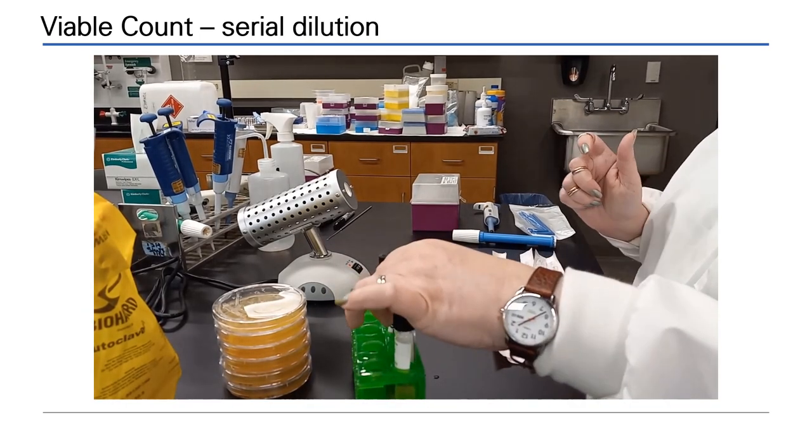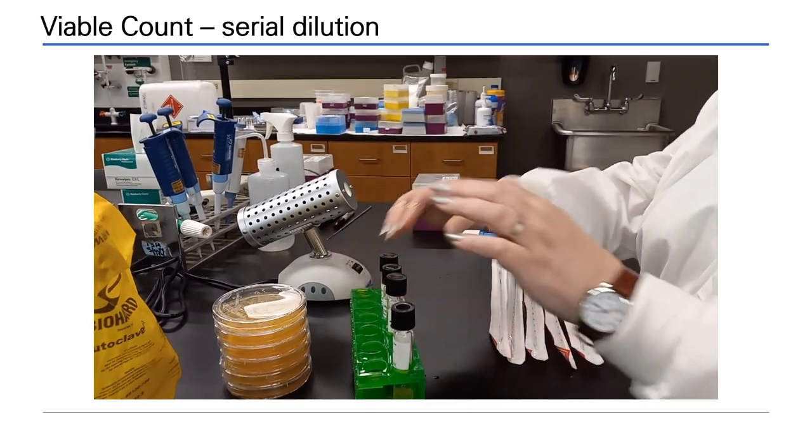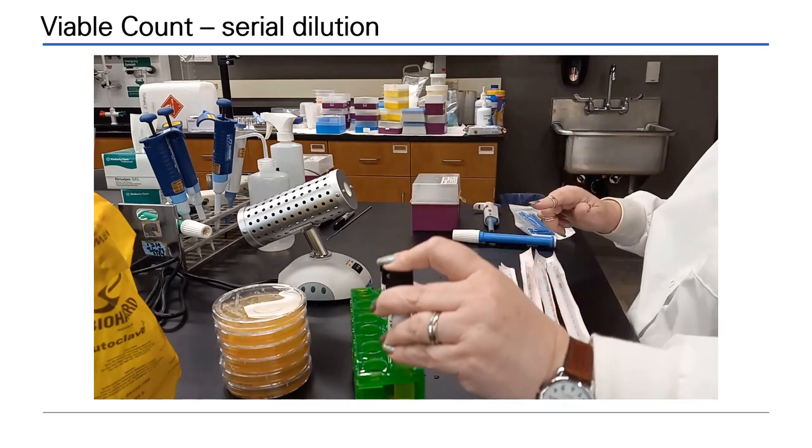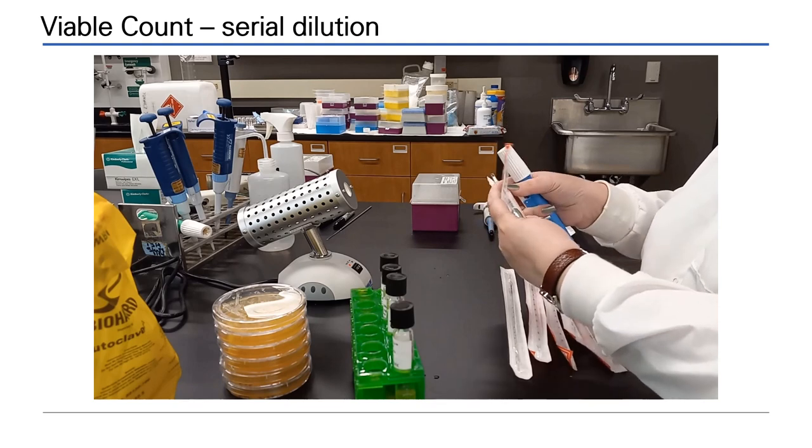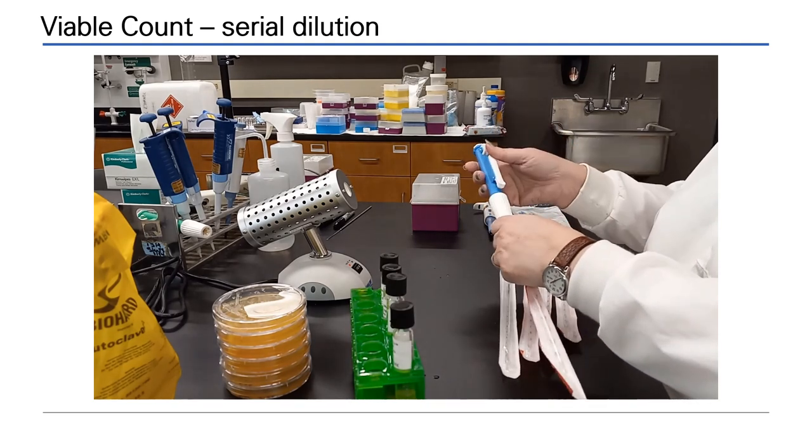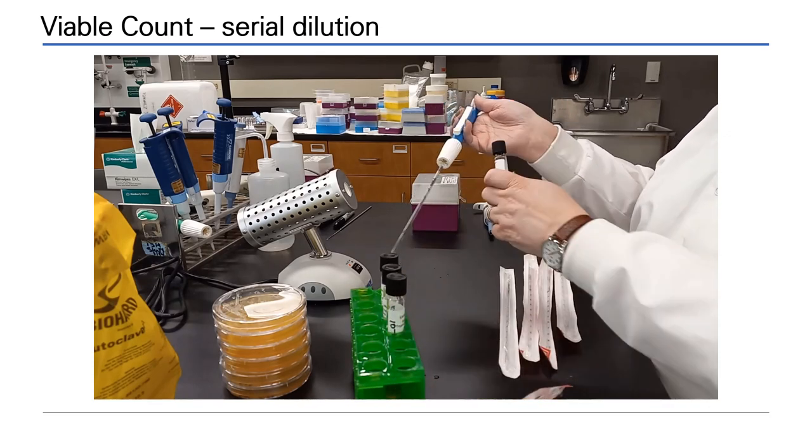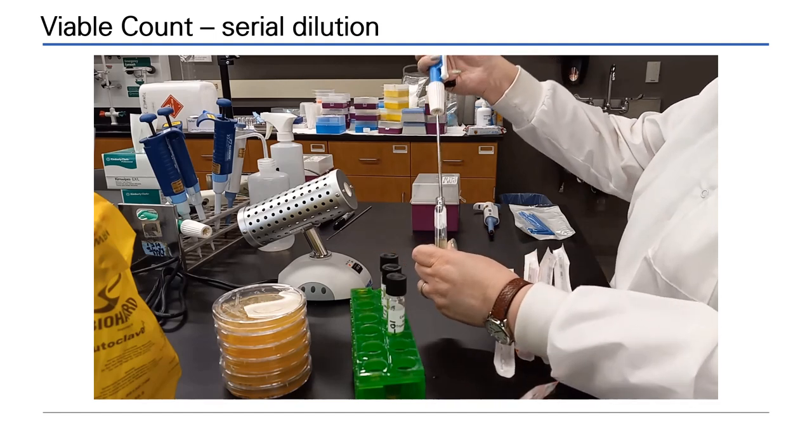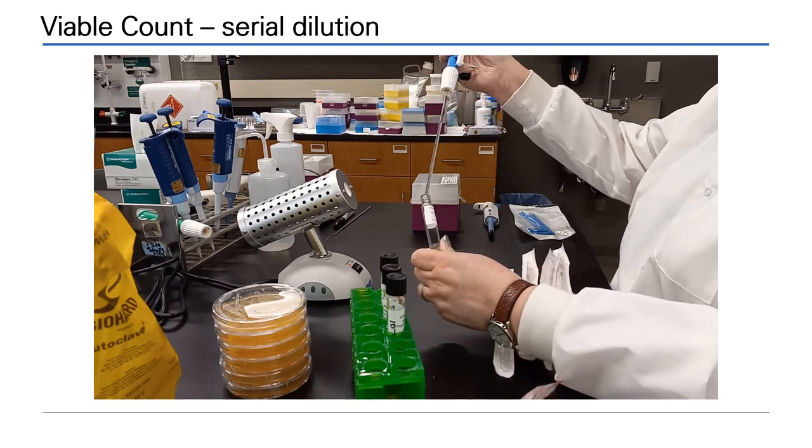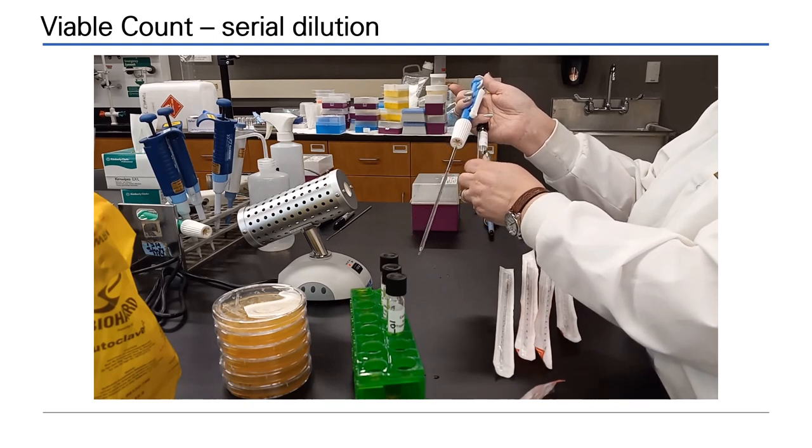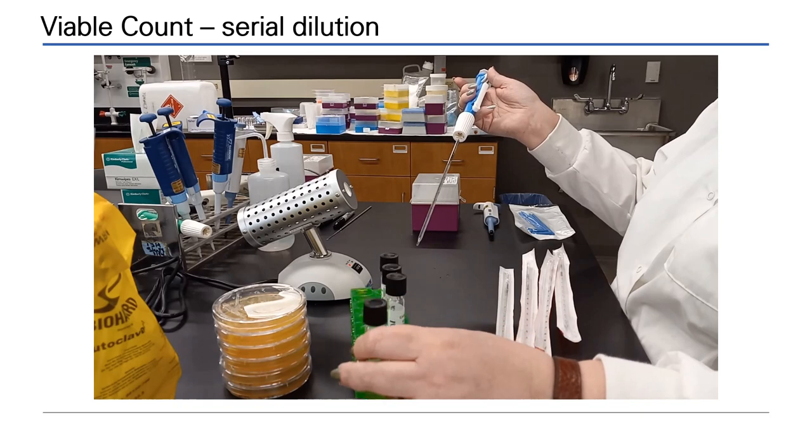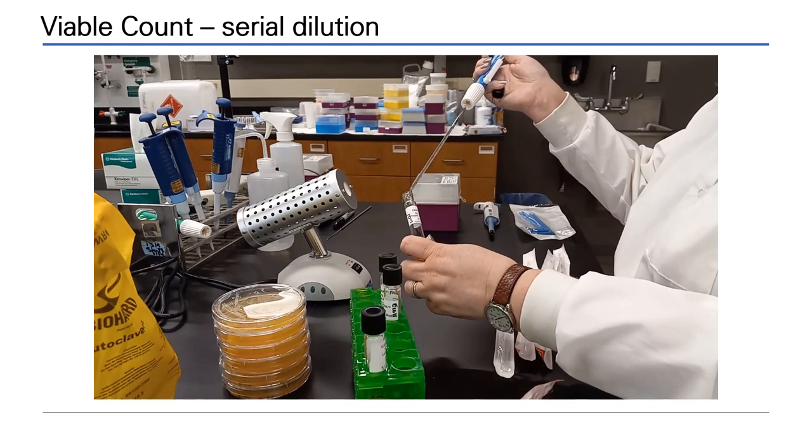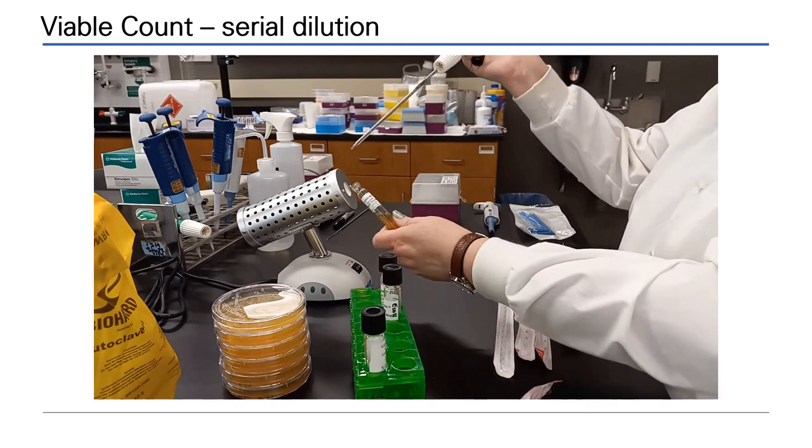The viable count begins by the aseptic dilution of your original sample. Loosen your caps and re-suspend your original culture. Using serological pipettes, you will perform a 10-fold dilution series. In each of the tubes for the dilution series, we have 9 ml of sterile broth. To perform a 10-fold serial dilution, you will simply remove 1 ml from the original and transfer it into the next tube in the series. The cells are transferred into the tube, but we do not use this pipette to mix and re-suspend those cells.